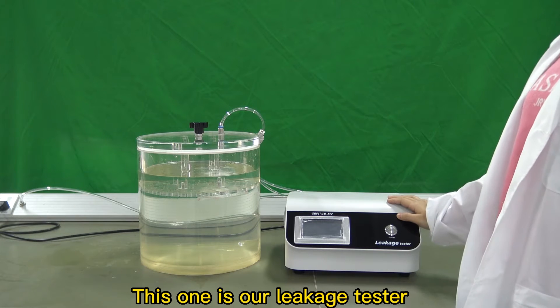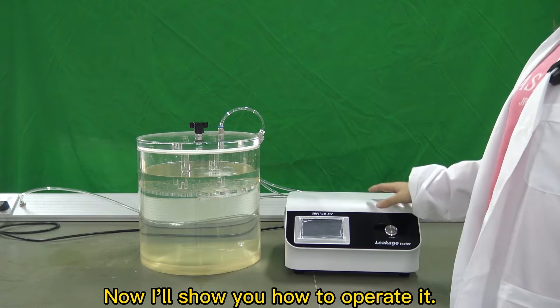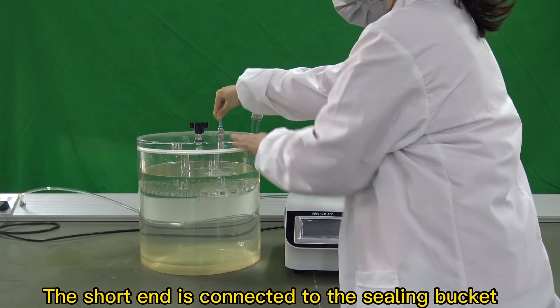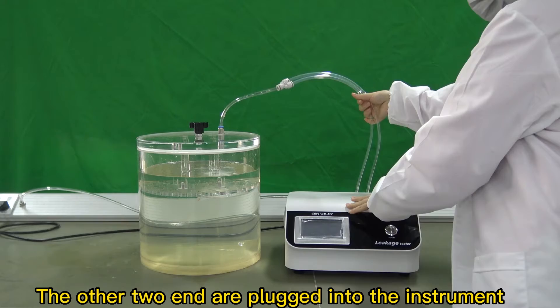This is our leakage tester. The model is GBM2. Now I'll show you how to operate it. First, we need to connect with the gas tube. The short end is connected to the sealing bucket, and the other two ends are plugged into the instrument.